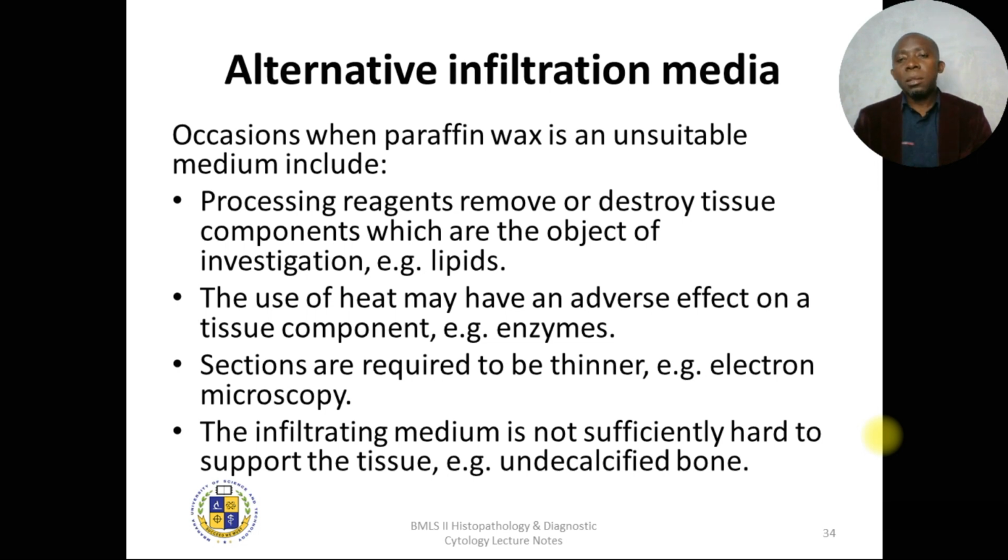So the use of heat may have an adverse effect on the tissue components, like enzymes. They can be destroyed and then we miss them out, yet they could be markers of interest that we need to study. But depending on the process we take the tissue through, we may lose some enzymes when we expose them to high temperatures, and we lose them.